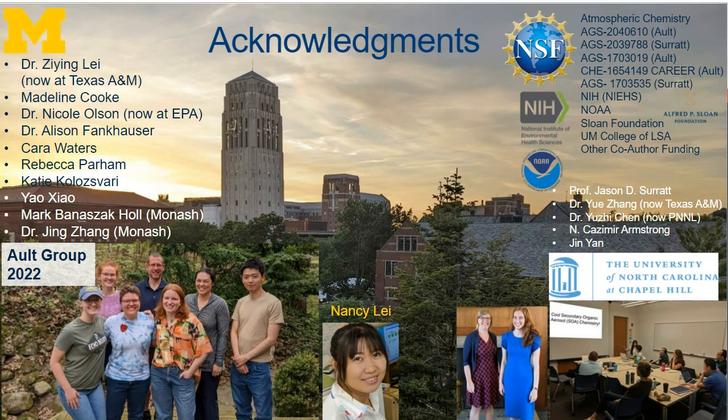Yeah, so the biggest thing that comes down to is that we want to be able to identify. We're looking at microplastics, for example, and we want to be able to match these spectra to known polymers. The EDX is only going to tell us that there's carbon present, but not what it is. It wouldn't tell us soot from certain secondary organic things from microplastics, whereas we can get that information with the Raman and the IR. And having both, a lot of the times the peaks will not be entirely clear if you're just using one of the two, but if you have both, then it ends up being really, really powerful. So getting that vibrational spectra, that functional group information is really key.